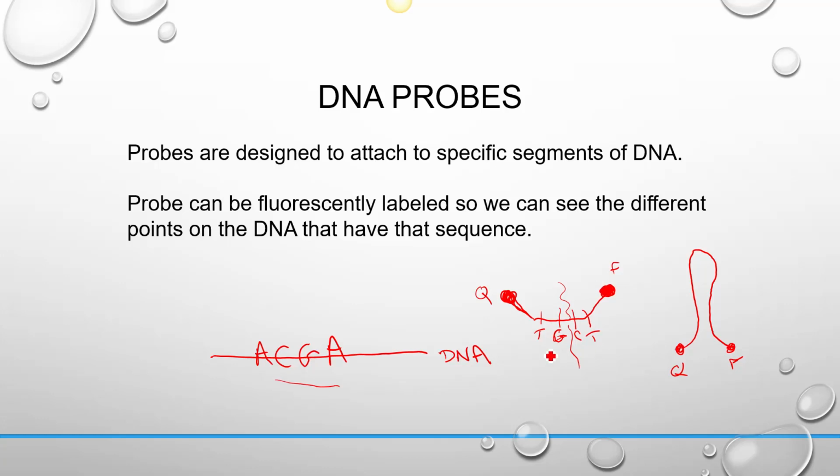So if we design a probe that will specifically bind to a sequence that is only found in, for example, Salmonella, and our sample has fluorescence, then we know that the probe has bound to our sample because our sample is Salmonella. Just to clarify a little bit about this quencher and fluorescence, because this might be confusing right now.